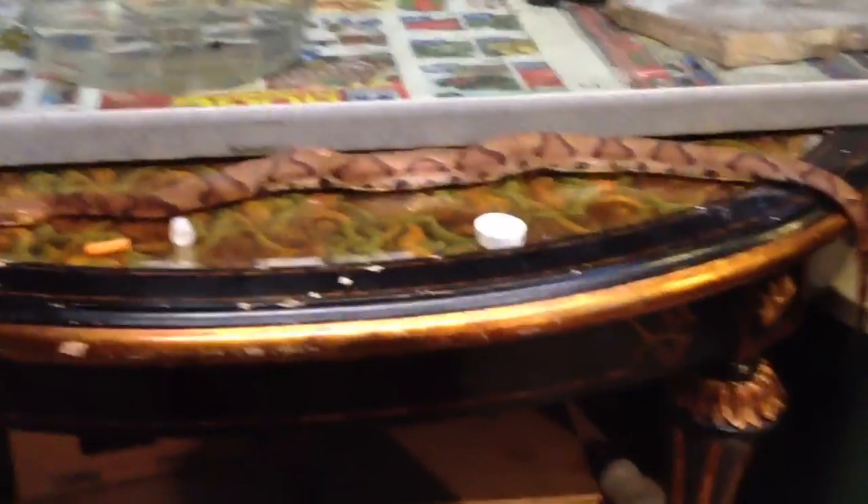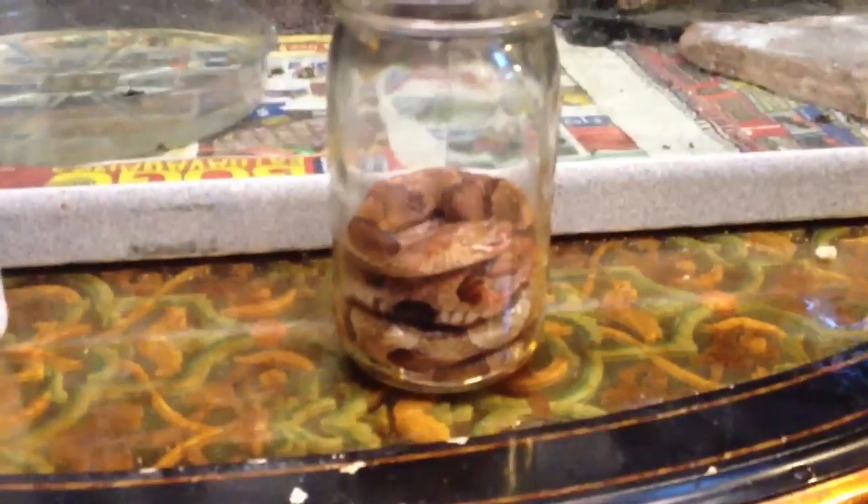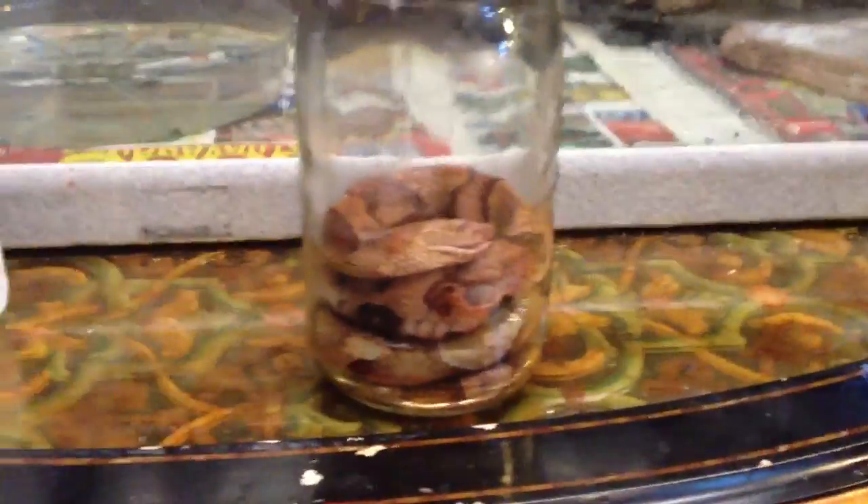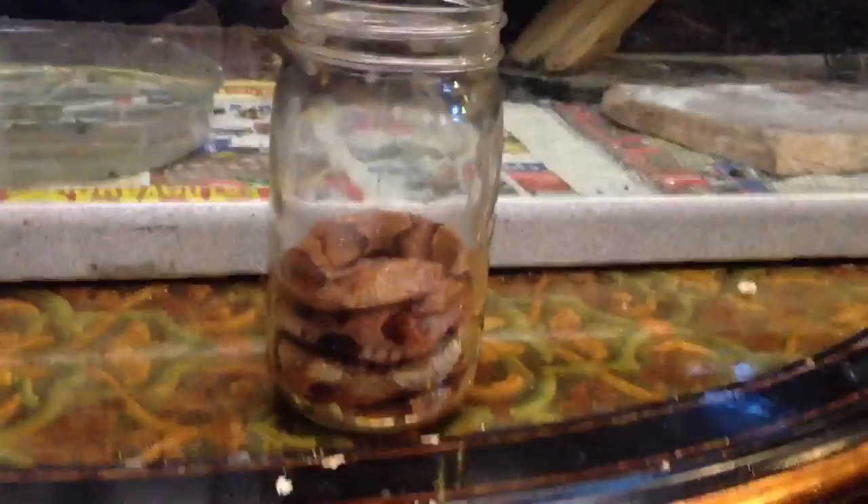That's pretty much all for this part. And then here's the hard part: putting the snake in the jar. Couldn't get this guy to fit right in perfectly, so I'm going to redo it later, but I'm going to show you the steps right now. You got the snake in the jar, of course.